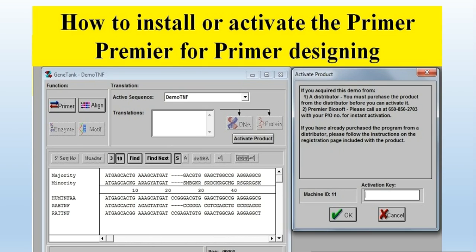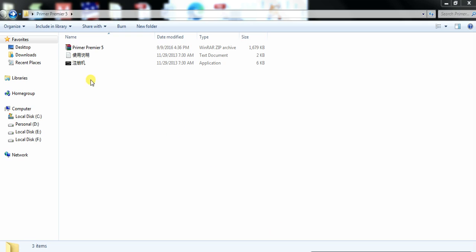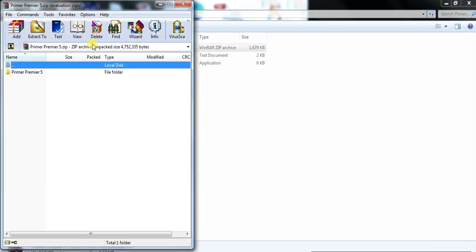So I thought, why not make a video to facilitate them. So how to activate or make workable Primer Premier? Let's start. You need to open the folder that contains the Primer Premier.